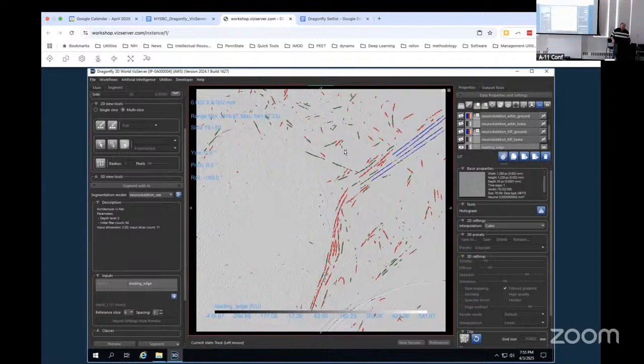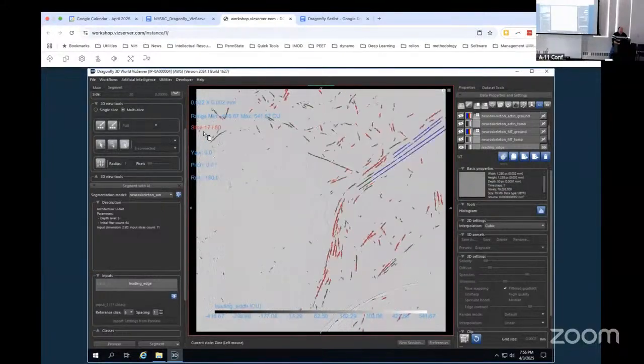All right. So that's Neuroskeleton. It's just seen 3 different types of cytoskeletal feature, and it works as an initial model for getting things going.